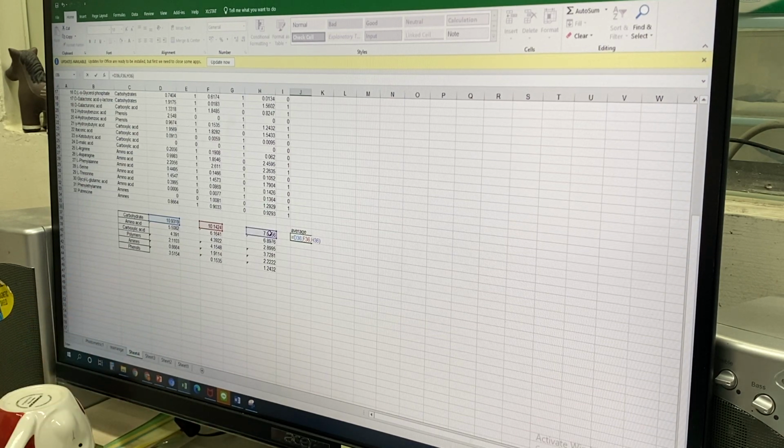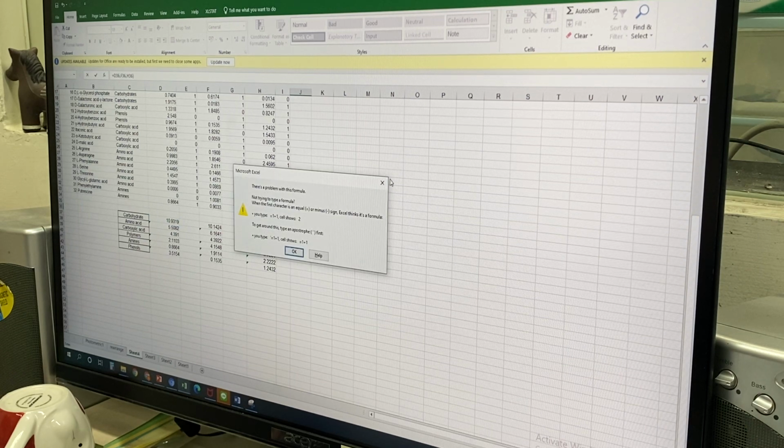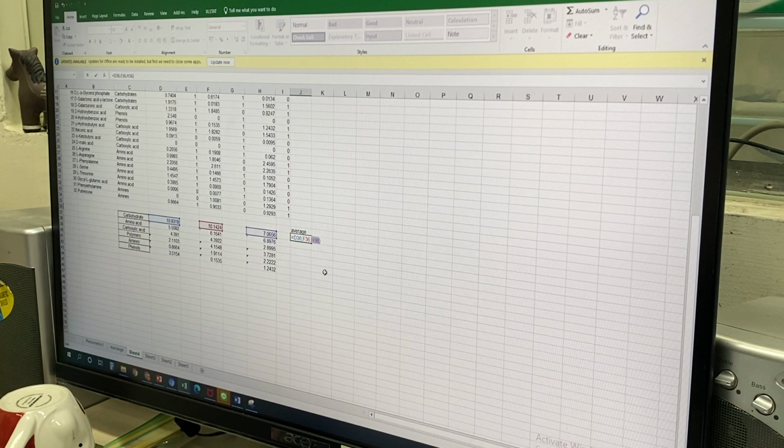Just close, enter. Oh, all this. Equals average, this one, this one. Okay.